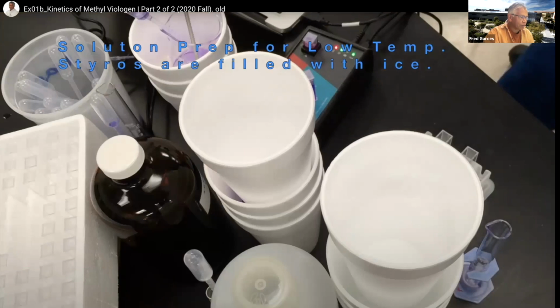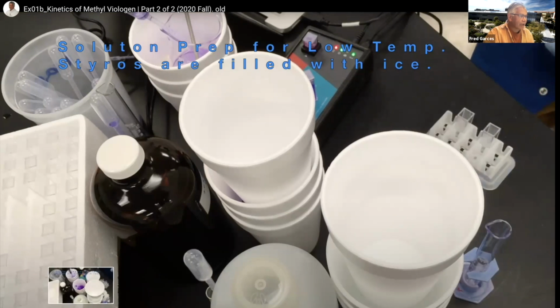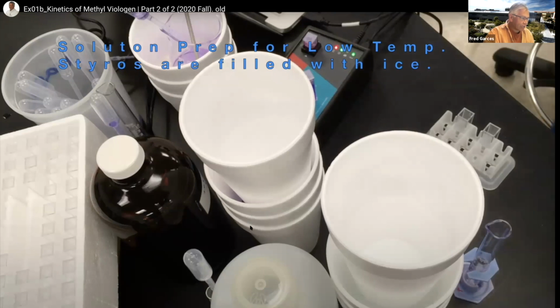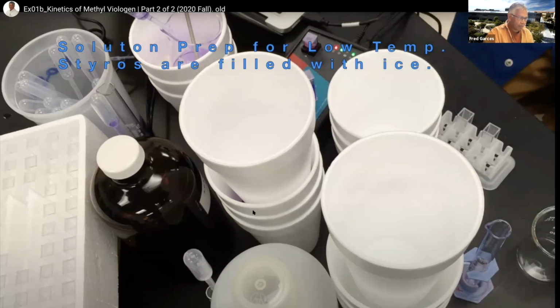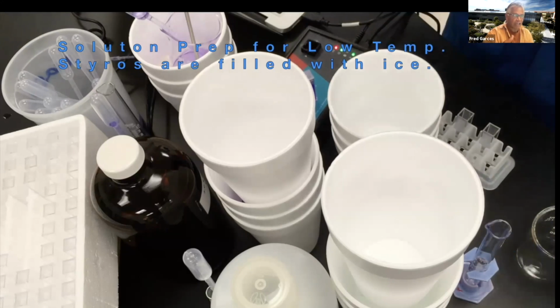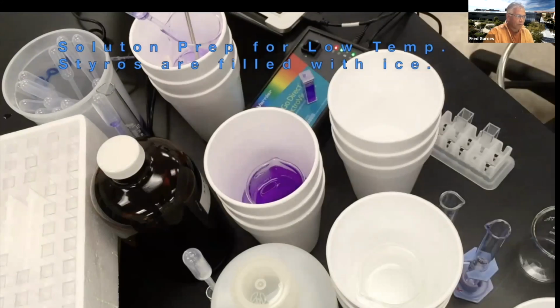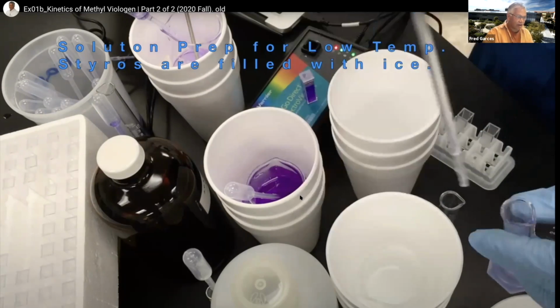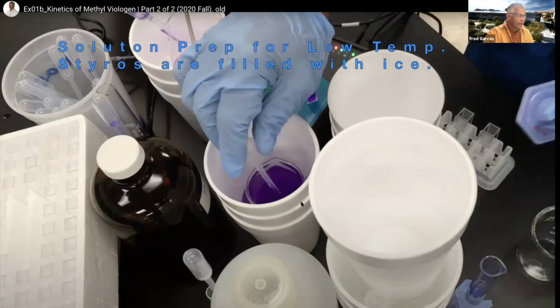You always got to calibrate your instrument. You can see that I'm putting ice not in the primary cup, but down here in the secondary cup. Because if I put it in the primary cup right there, the temperature fluctuation will be too drastic. It'll be going up and down. So I actually have the ice down here in the second one, then I cover it. I cover it, okay?